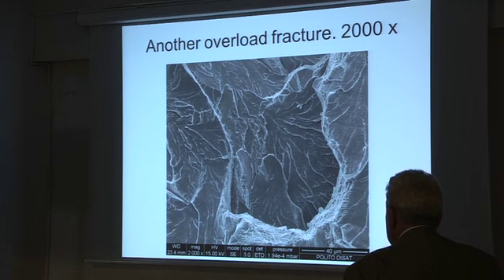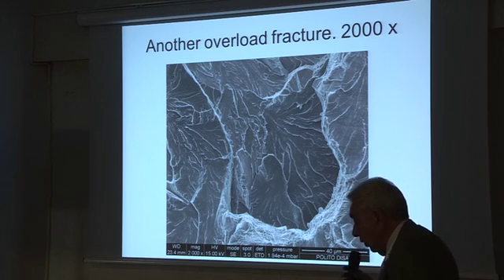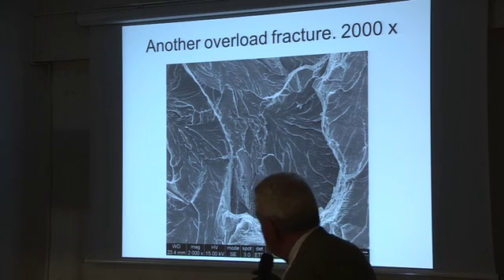This is another case of overload fracture. We are seeing fracture not through a pearlite colony, but through separation of a single crystal. This is a ferrite crystal, and you have that kind of river pattern that we were speaking of in the beginning.